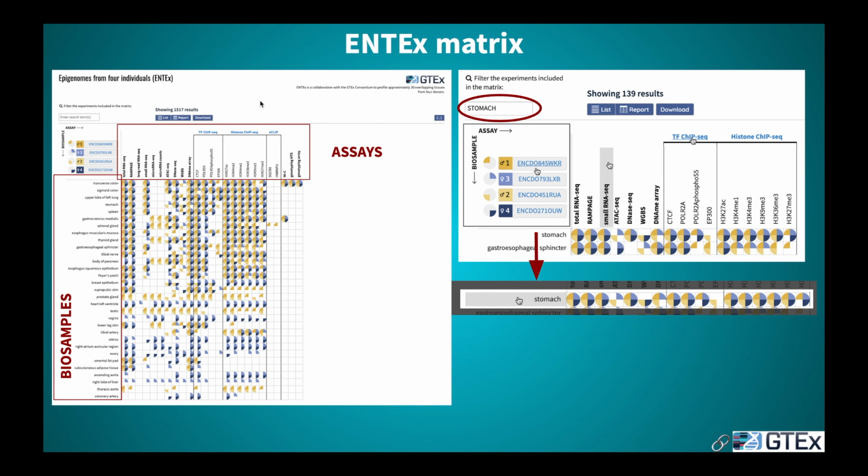The 4 human donors are listed on the leftmost corner of this page, and here is the expanded view of the same. If you would like to explore what these donors indicate or what their age and different aspects are, you can click on these and reach the relevant pages.